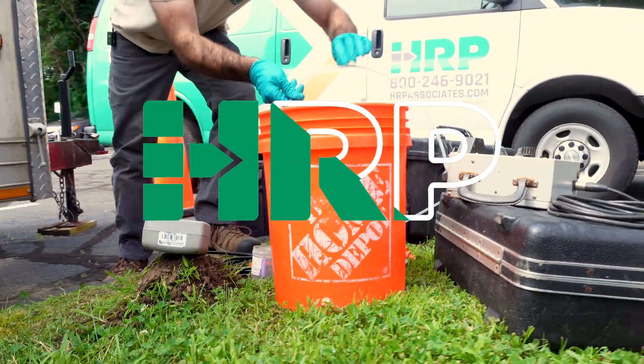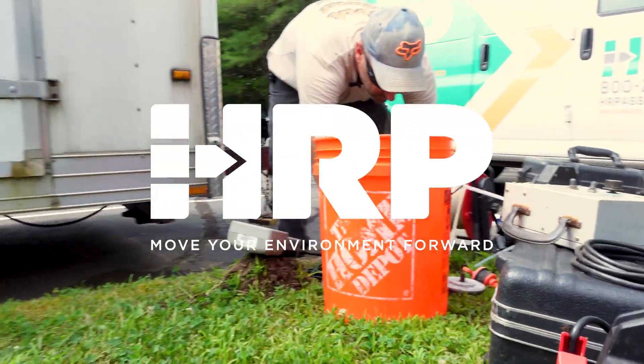Today we're going to show you the proper use of a peristaltic pump and how to set your tubing in a well to do low flow sampling.